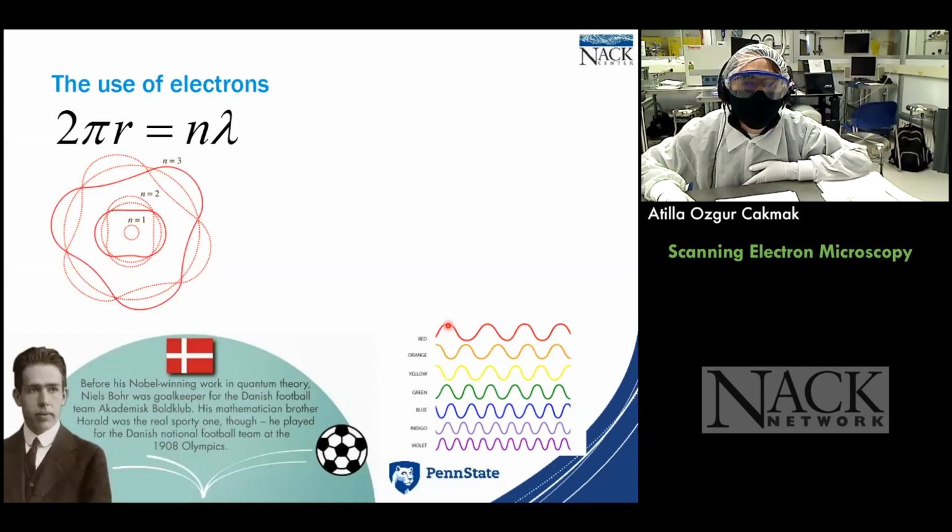The peak-to-peak separation was 700 nanometers. Now we're talking about the circumference of an orbit of an atom. So this is going to be really like 1,000 times smaller than what we have here. So the resolution will be incredibly enhanced too, like 1,000 times easily.